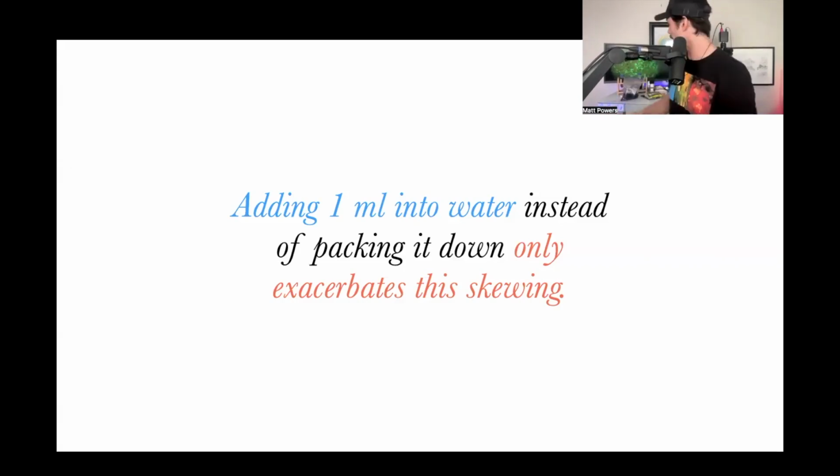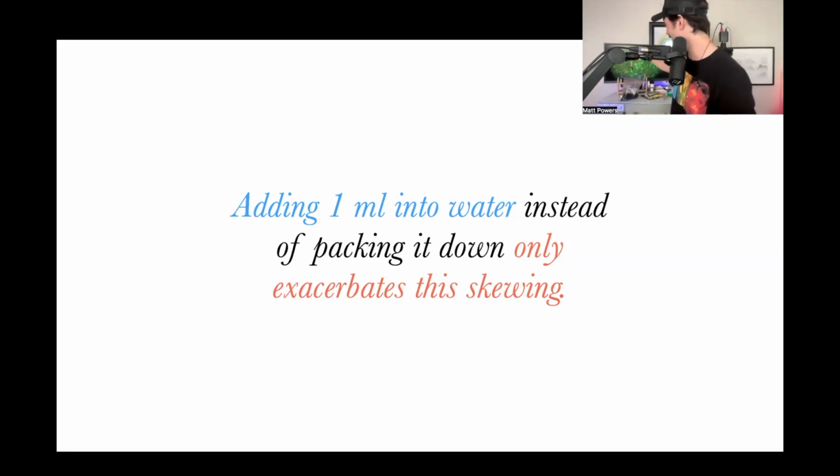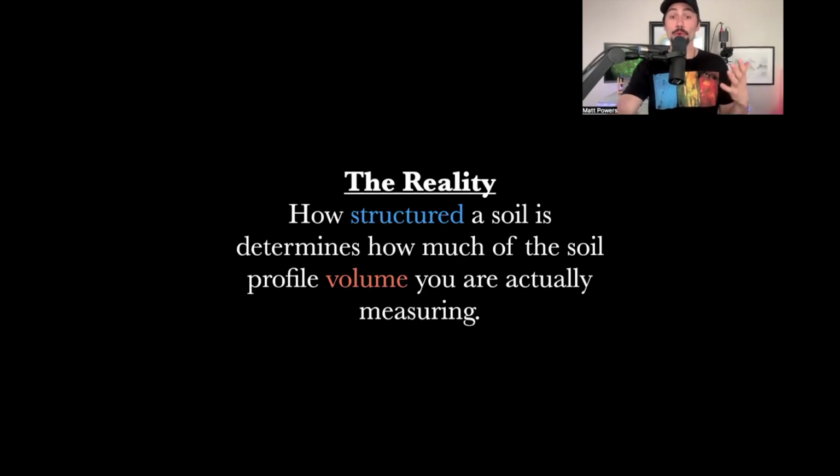And by the way, adding 1 ml to water in little bits, good luck trying to be accurate unless you've granulated it and broken it down and potentially dried it and all this stuff. I like seeing how things are. I like to let nature speak to me. And so doing that doesn't appeal to me. And so the reality is how structured a soil is determines how much of the soil profile volume you are measuring. And hopefully I demonstrated that well today.